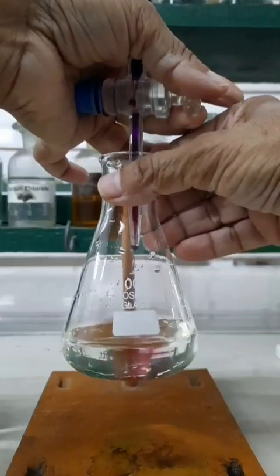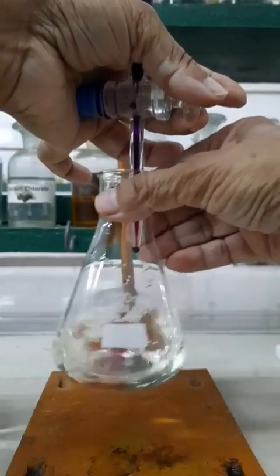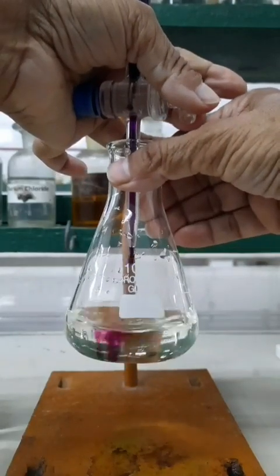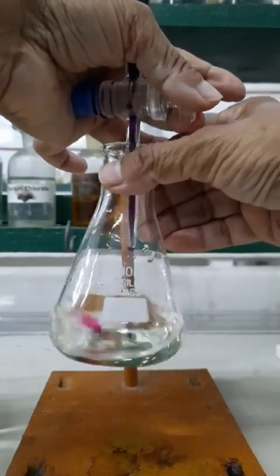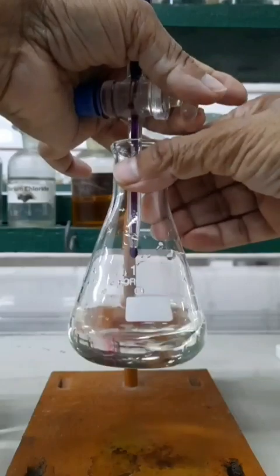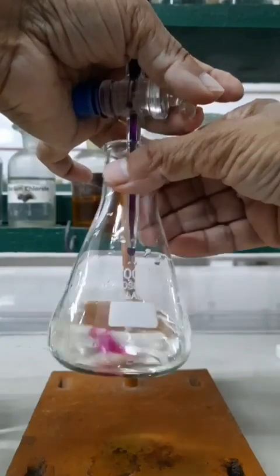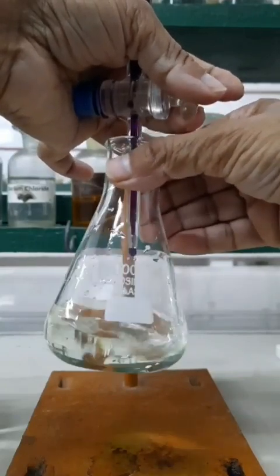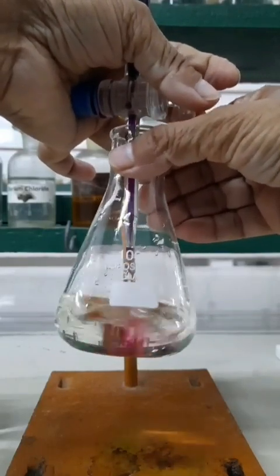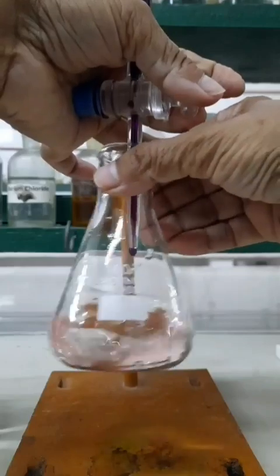This process will continue, and you have to reach the reading of approximately 9 ml, because from the initial reading we found that our answer, or the endpoint, lies between 9 and 10. Now after reaching 9 ml, just add drop by drop with continuous stirring, so that we can find the color change by adding just 1 drop of potassium permanganate solution, in order to get the exact endpoint.